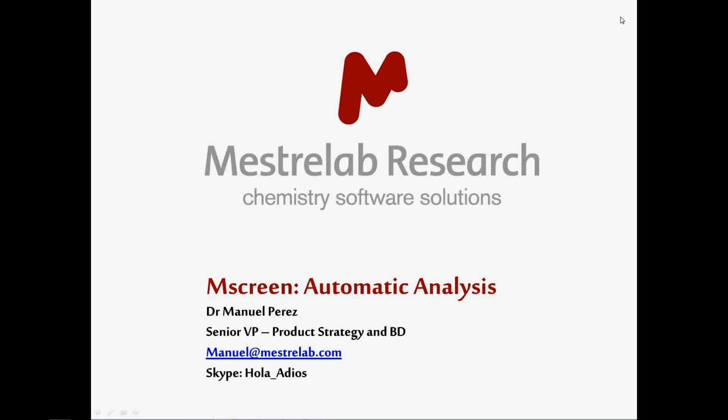Right now. The session today, I thought about breaking it into two distinctive parts. First, we're going to go through a series of slides in which we are going to define some of the challenges that we will find when trying to automate the analysis of NMR screening results. Some of these challenges can be easily prevented if we plan ahead when we are preparing our screening campaigns or when we are preparing our screening sets.